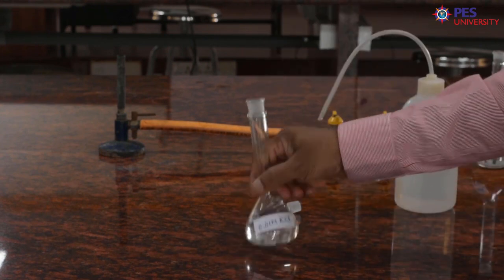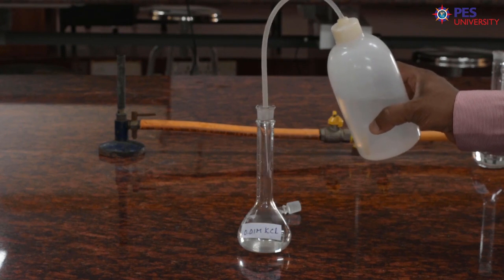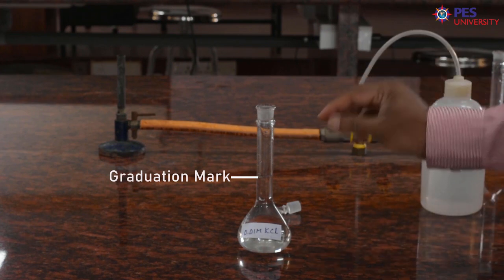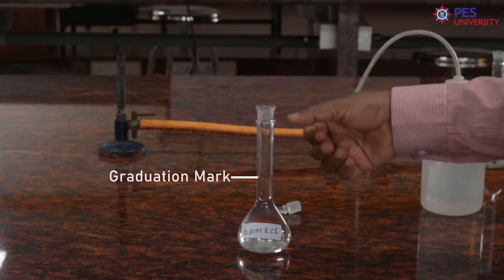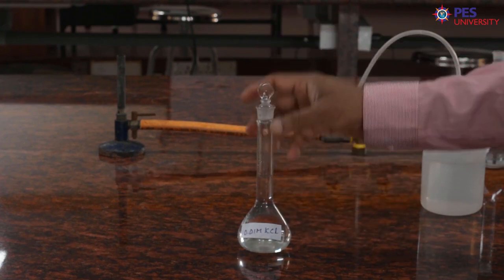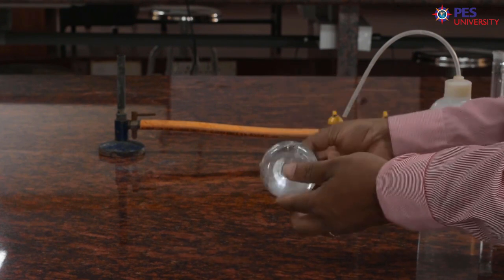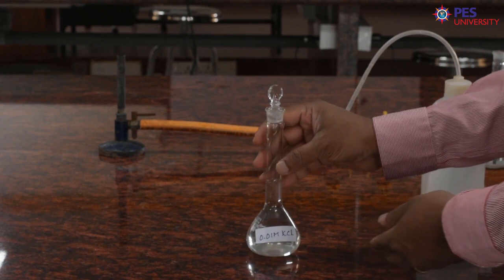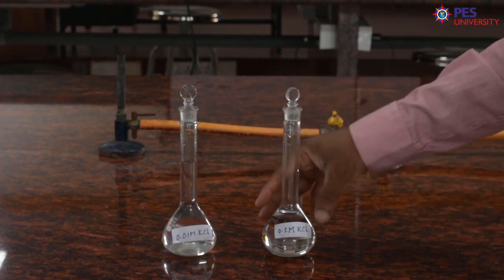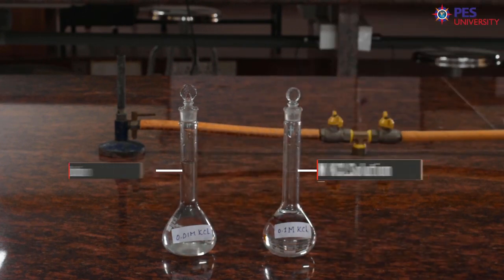Then swirl the flask. Then add water just below the mark using a wash bottle. Again, for the final makeup, fill the burette with distilled water, then add drop by drop to make up to the mark. After that, close with a stopper, then tilt the flask and shake the bulb for uniform concentration. Now we have prepared two differently concentrated KCl solutions, that is 0.1 molar KCl solution and 0.01 molar KCl solution.